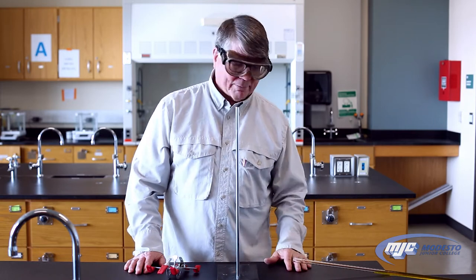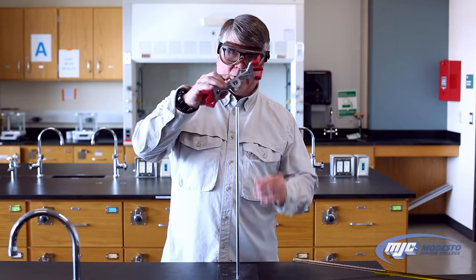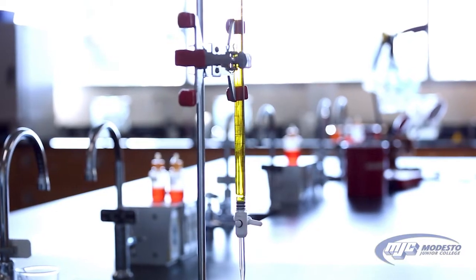This is an explanation of how to use a volumetric burette. And remember, always wear goggles in lab. You're going to need a ring stand, a burette clamp that looks like this, and your volumetric burette, as well as a solution that's going to go in it.